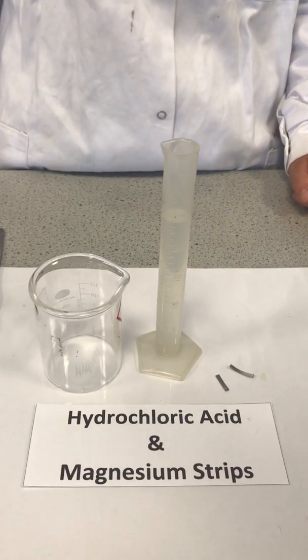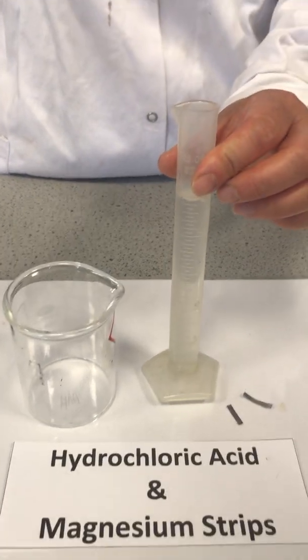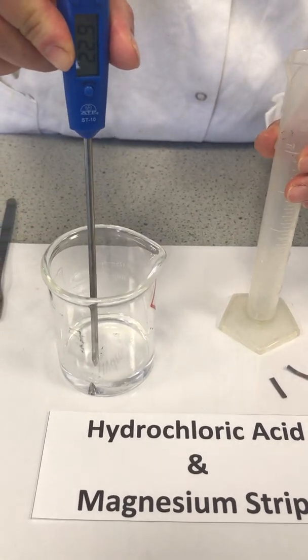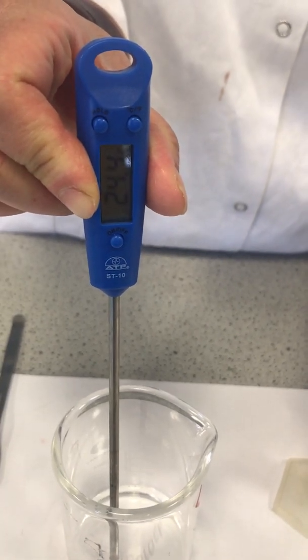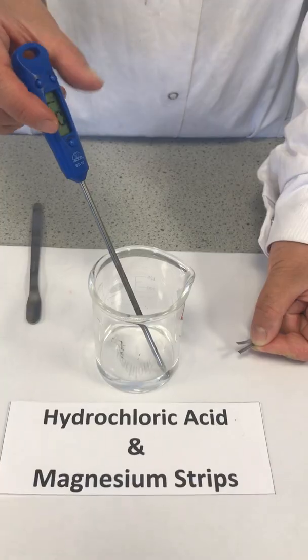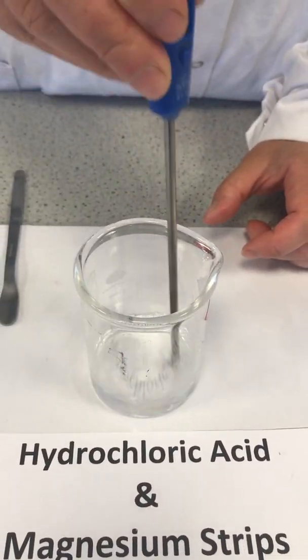Experiment 3. Reaction between hydrochloric acid and magnesium strip. We measure 25 ml of hydrochloric acid in a measuring cylinder, pour this acid into the beaker, and record the temperature of the acid. Now we will add the magnesium strip into the beaker, start stirring, and record the temperature.